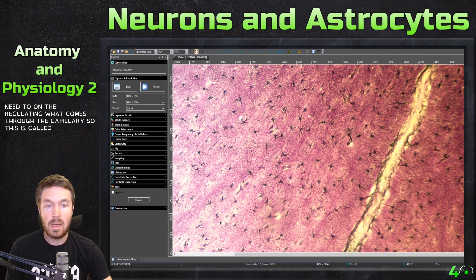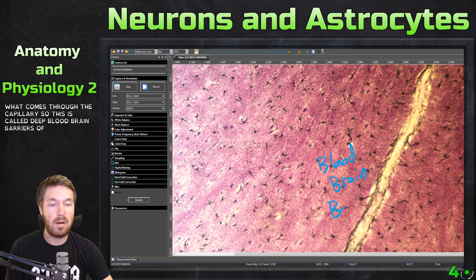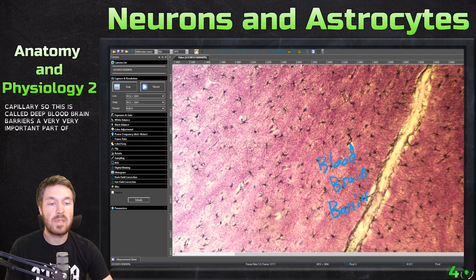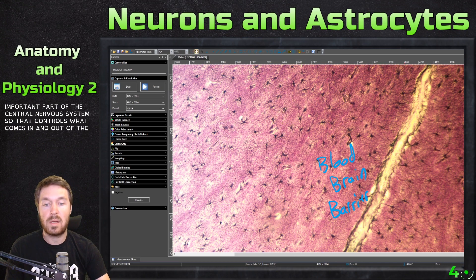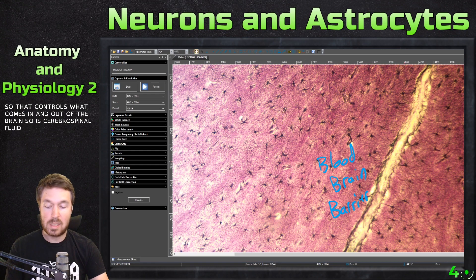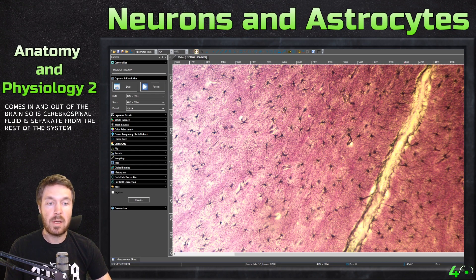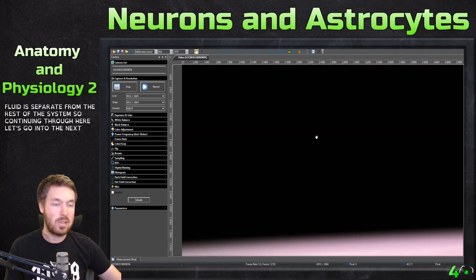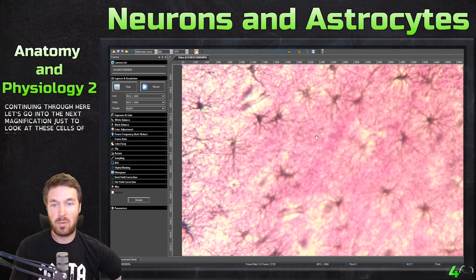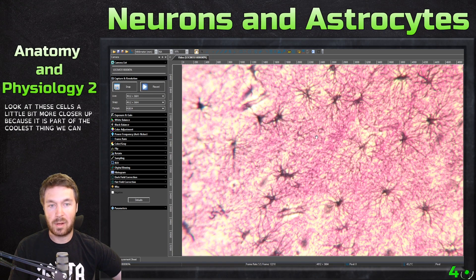So this is called the blood-brain barrier — a very, very important part of the central nervous system. That controls what comes in and out of the brain. The cerebral spinal fluid is separate from the rest of the system. Let's go into the next magnification to look at these cells a little bit more close up, because it is probably the coolest thing we can look at here.